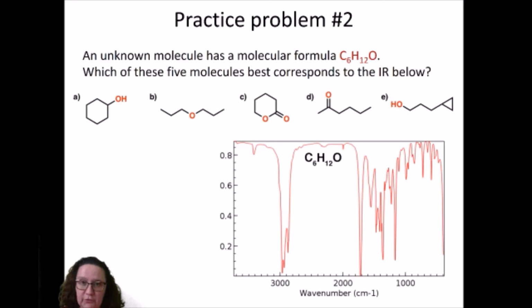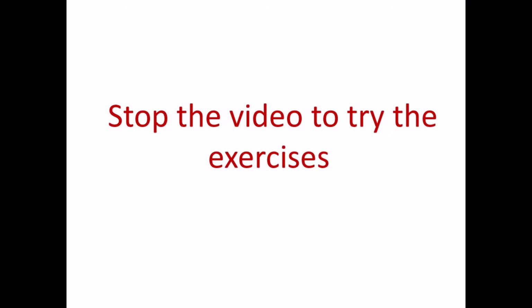Again, another practice problem. And again, I'm going to ask you to stop the video, have a look at the different options you've been given, and identify to which compound this particular spectrum corresponds. As in the previous example, look at the bands that are present and the ones that are absent, and it will give you an indication of which compound you're looking for. Stop the video now, please.